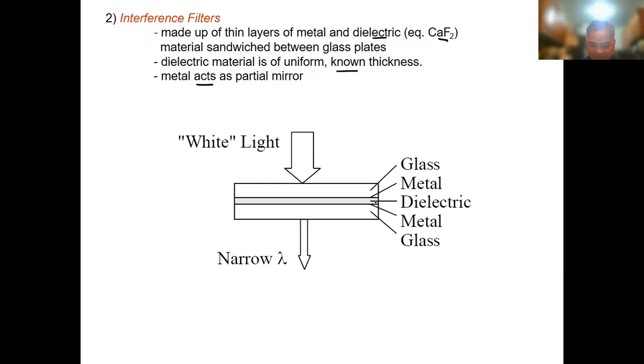So usually ito yung pag-sandwich niya. So you have the dielectric material there, and then metal, and then glass. So you sandwich it. I think that's what you do usually, similar to IR. Yung hindi pinipellet, yung sinasandwich. Because some of the IR, you can pelletize it, you mix it with KBr. Pero KBr talaga yung material doon. But we also have the one that sandwiches the thing.